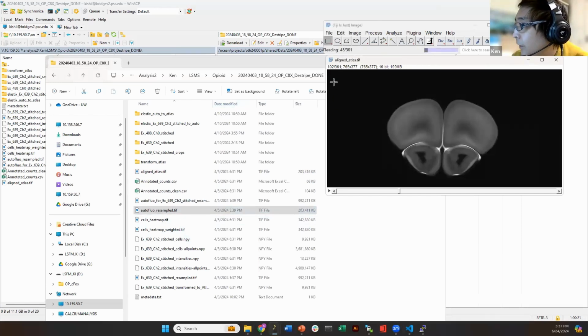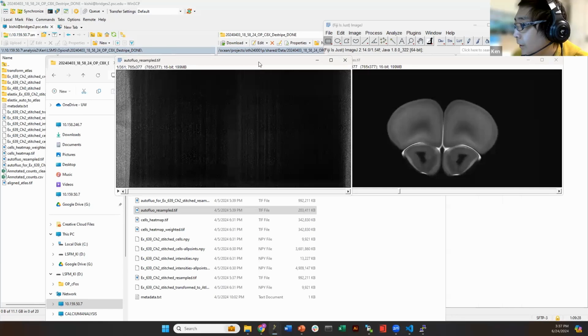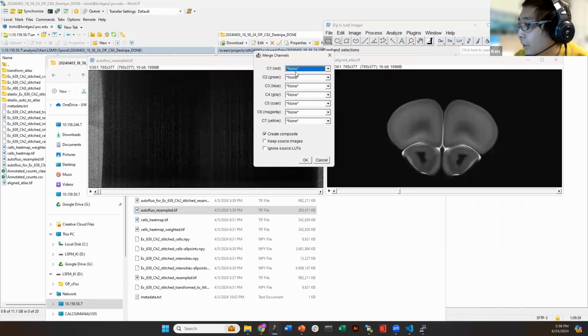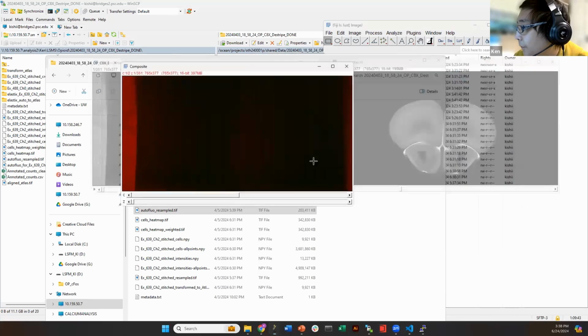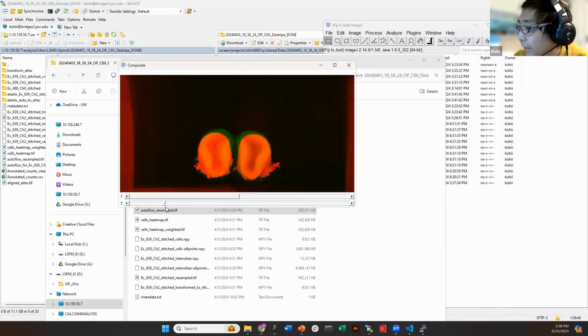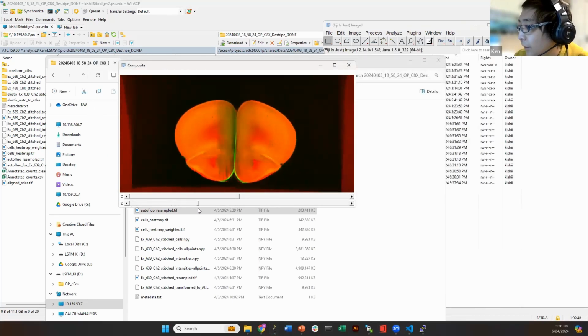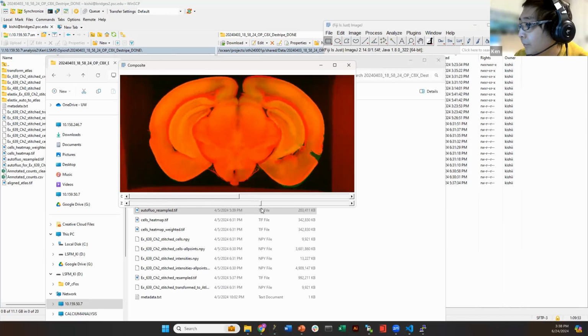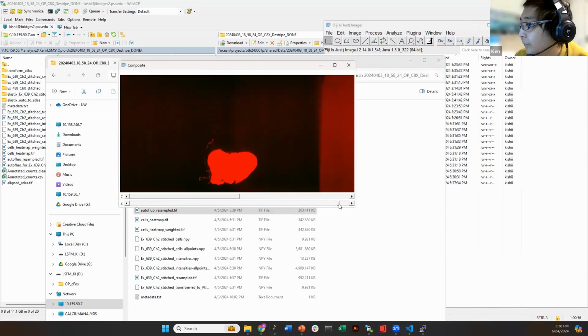If you load these onto ImageJ, you will have 2 files that have the exact same shape, 361 Z-planes, 765 by 377. If you overlap these 2 images with an ImageJ function in red and green, you will have something like this, showing the overlap of the red and green images.